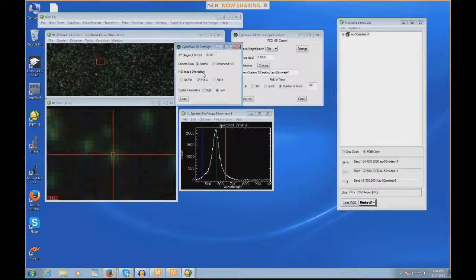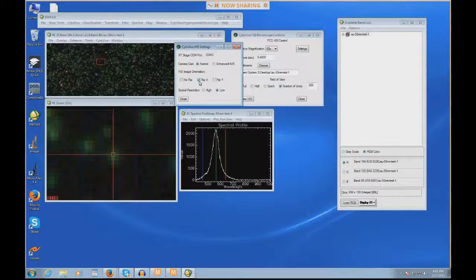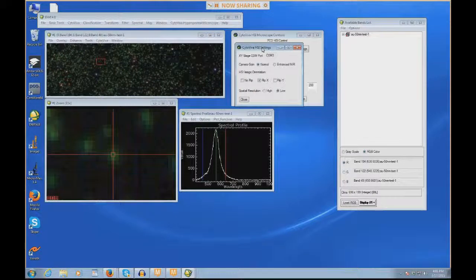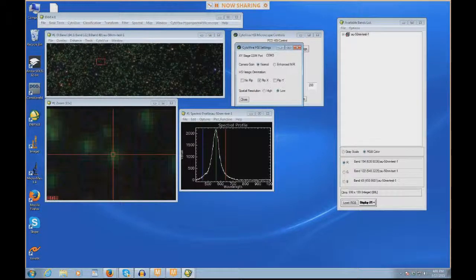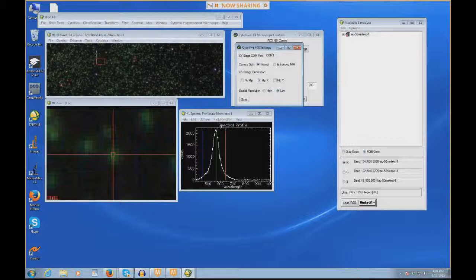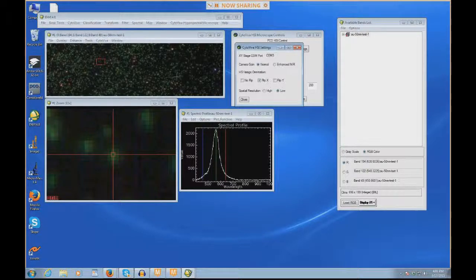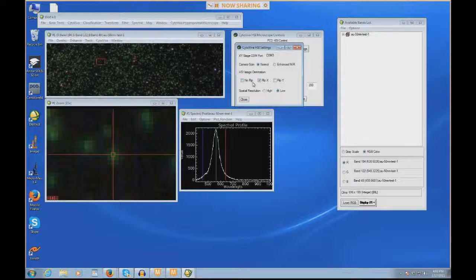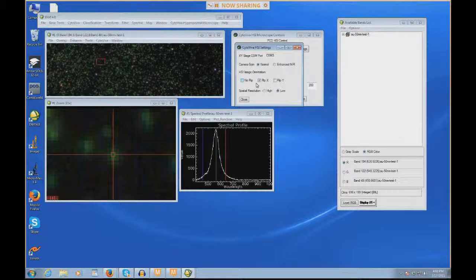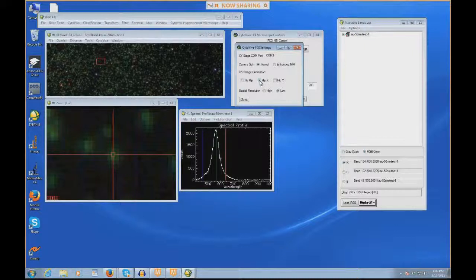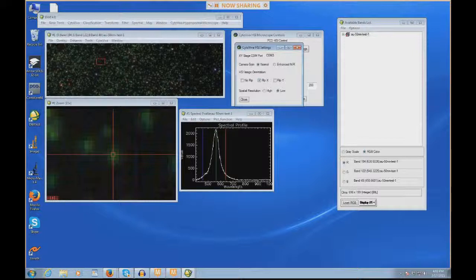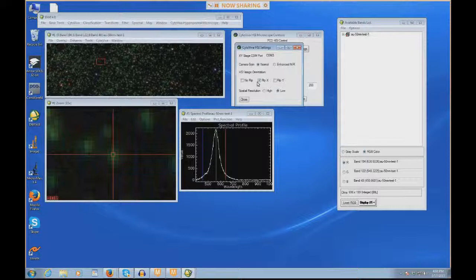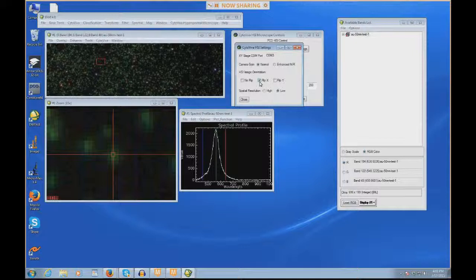The HSI image orientation, this is the way the image is displayed when it is done being scanned. Here we have the FLIP-X checked. This is the default because when you look in the microscope, what you see on the left is actually what's on the left in this scan. The reason why FLIP-X happens is because of the dual port on top of the trinocular head of the microscope actually flips the image to the spectrograph and camera combination. It flips that image in the X-axis because of the mirror that's inside. This simply flips the image back around to where what you see on the left in the microscope is on the left when the scan gets completed. If for some reason you ever mounted your spectrograph to the top of the microscope instead of the back of the dual camera port, you would not need the FLIP-X.